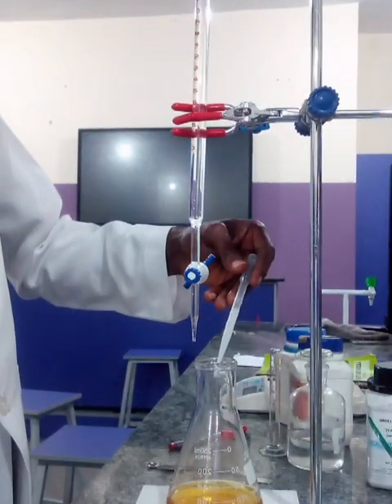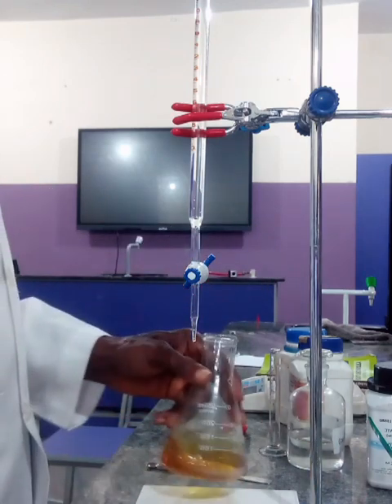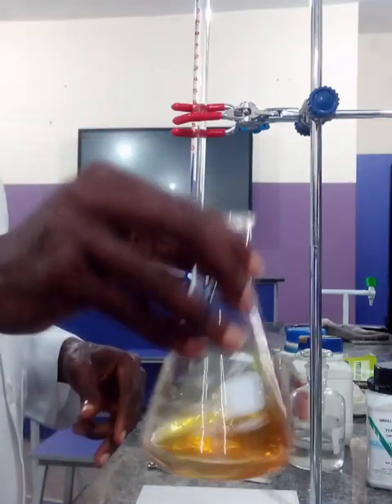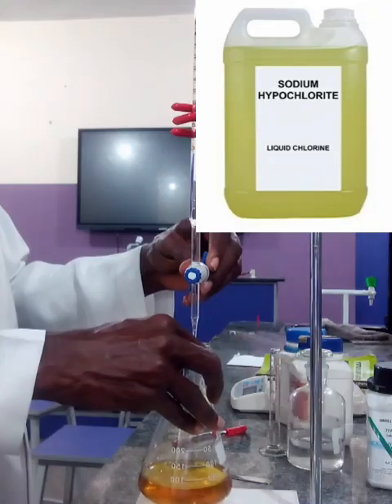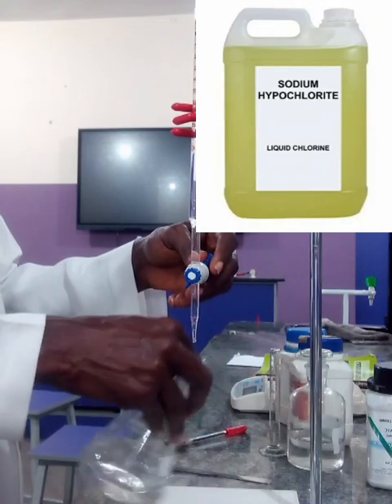Your bleach actually contains sodium hypochlorite, and the sodium hypochlorite needs to be changed to chlorine.